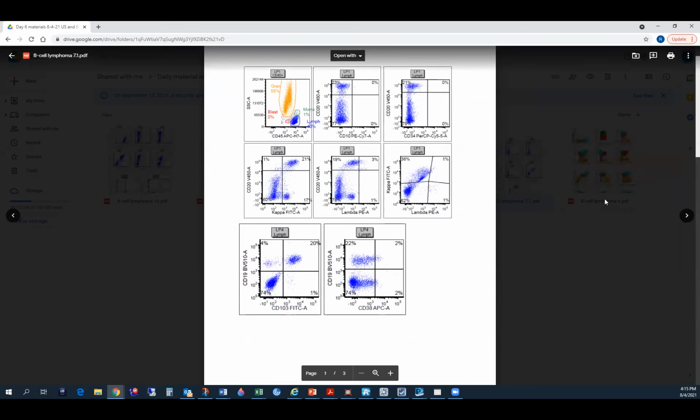I'm so sorry. I didn't get the chance to look at today's cases, but I looked at 7.1 quickly. We were just discussing hairy cell leukemia, and to me, the phenotyping looks very similar to hairy cell. So I'm just going to keep that in mind and start.